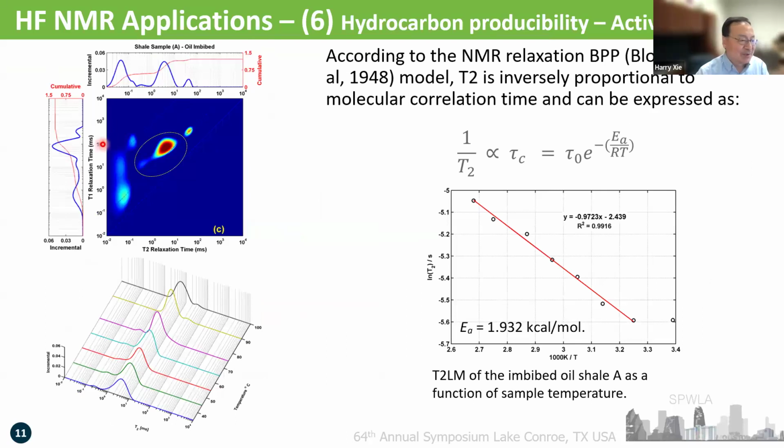One other example of NMR application is to use NMR to calculate the so-called activation energy. If you studied chemistry, you understand. For the molecules to move from one state to another, you need to overcome the activation hump. So NMR can be used to do the activation energy measurement.